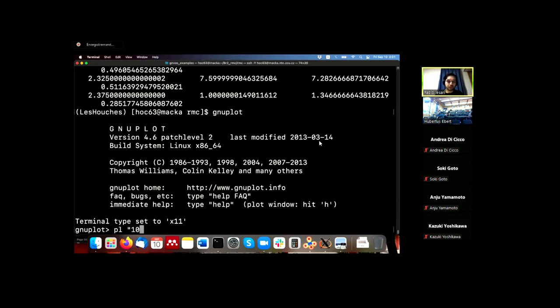Of course, in this case, it's a two-atom molecule, so what we have is basically only a single peak. I will plot the second and the third column just to show you the difference between the last configuration and the average.